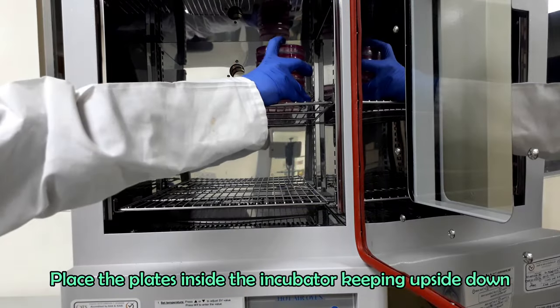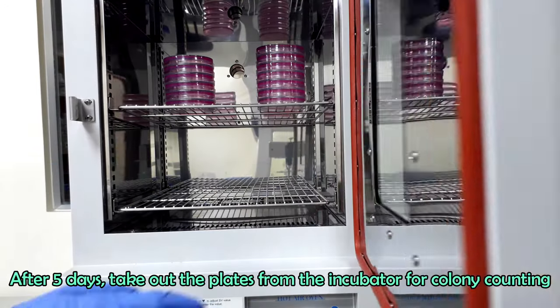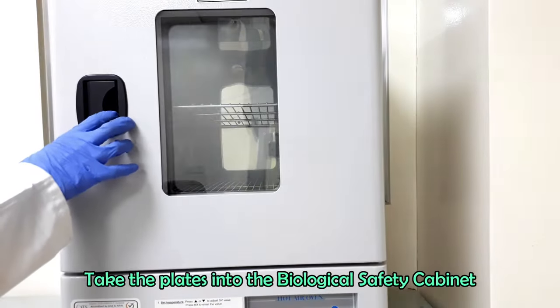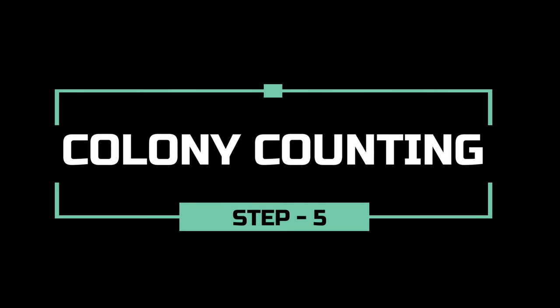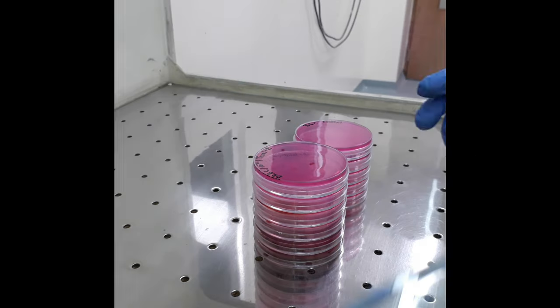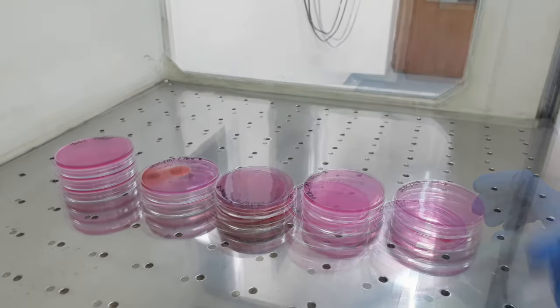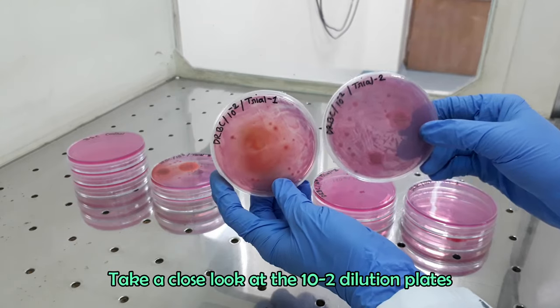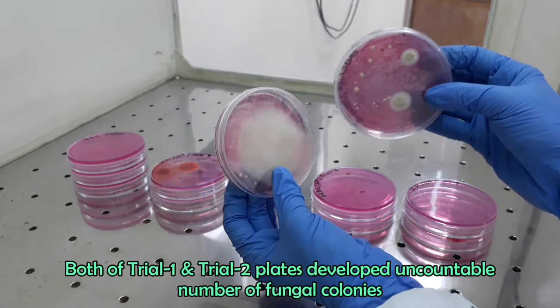Incubate the plates at 25 to 30 degrees Celsius for 5 days. After incubation, take out the plates from the incubator for colony counting. Let's count the colonies. Take a close look at the 10 inverse 2 dilution plates. Both trial 1 and trial 2 plates developed an uncountable number of colonies.